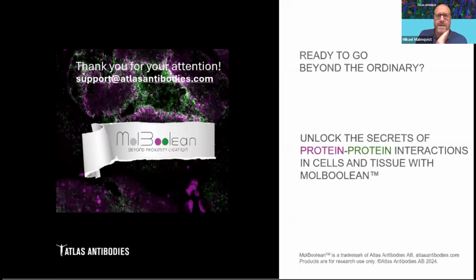Next question. Are antibody oligo complexes available through Atlas? And if yes, what is the cost, or do we need to generate them ourselves? So the MolBoolean product contains all of the components you need to perform MolBoolean, other than the primary antibodies. The antibody probes, which are the secondary antibodies with oligonucleotides attached to them, are part of the kit. So you don't have to generate them yourself.